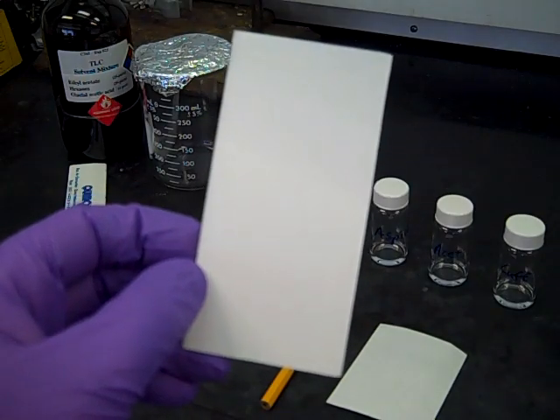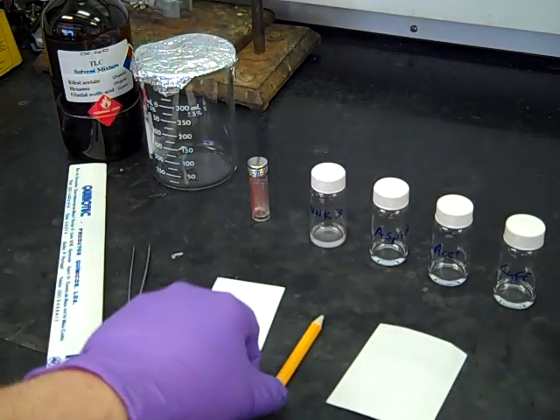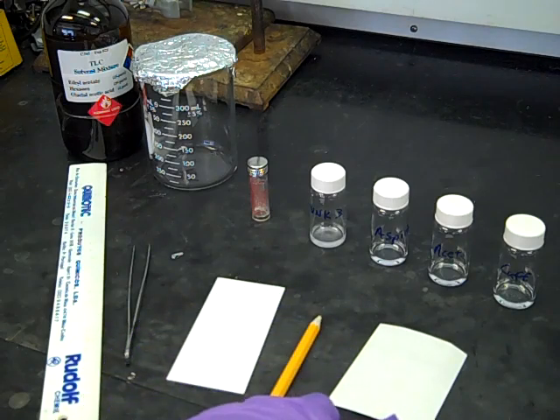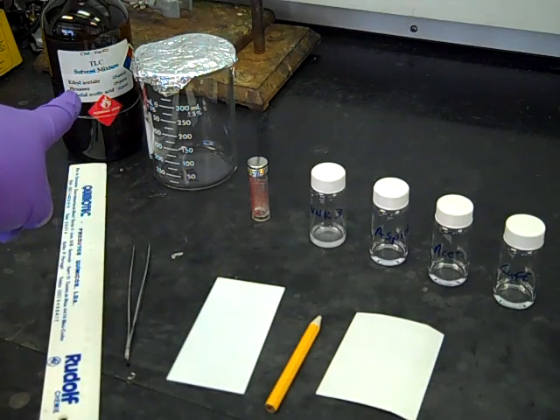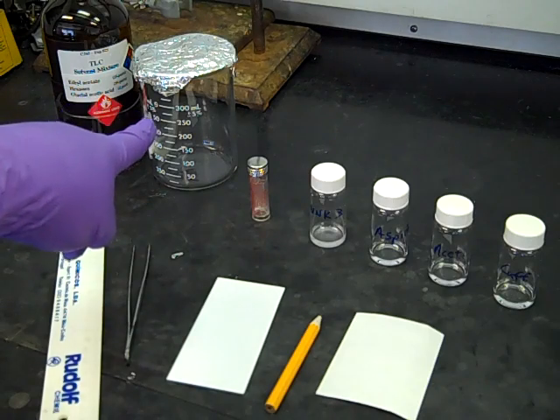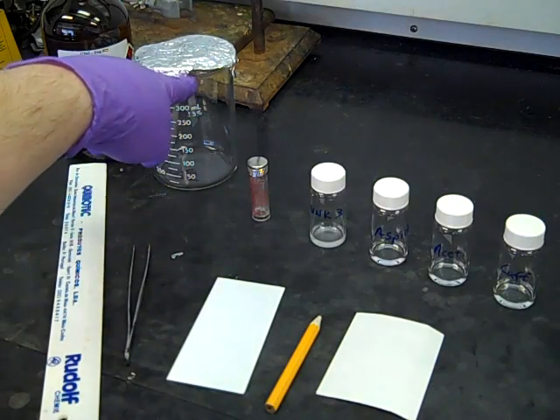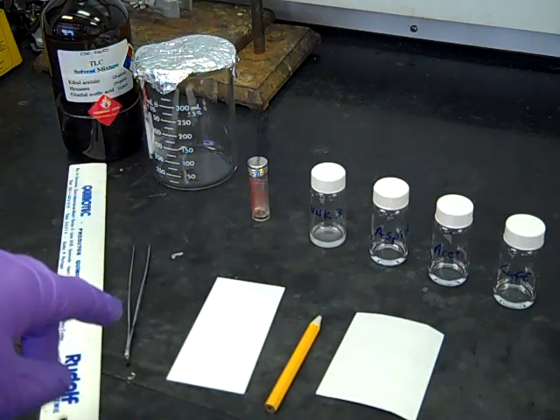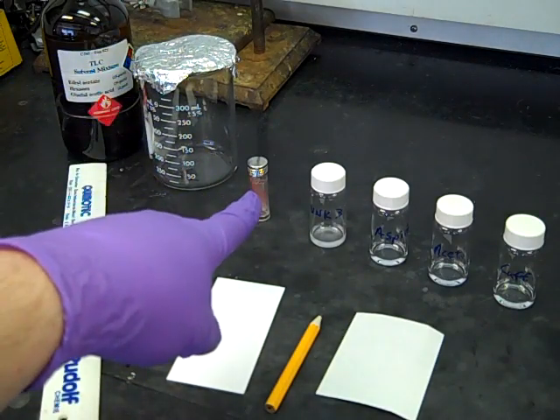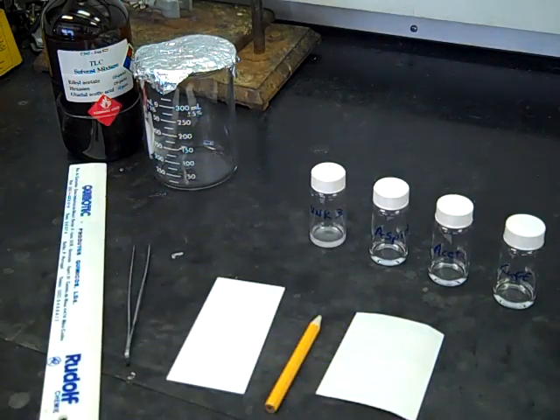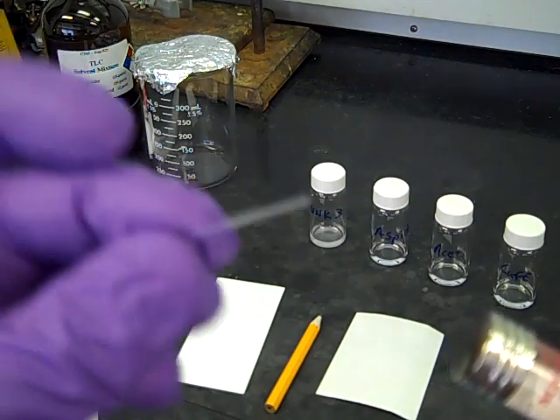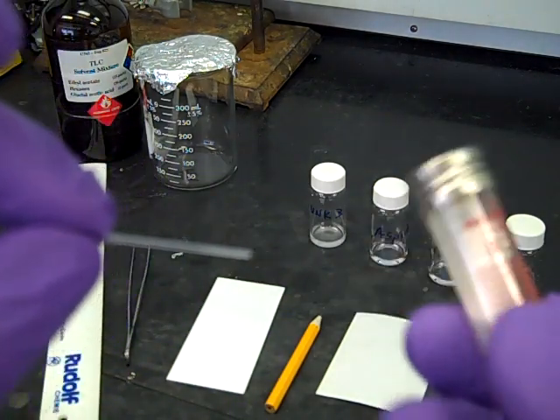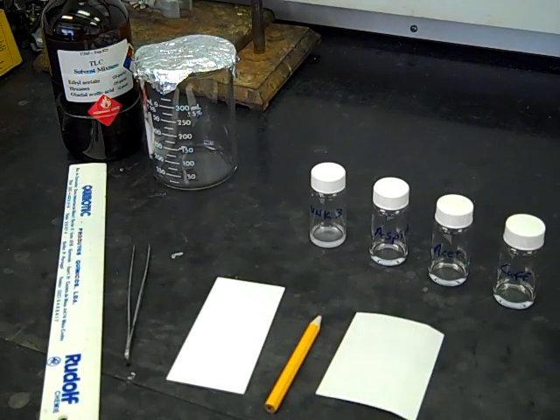You'll need a pencil to write on the plate, a filter paper wick, and our TLC solvent back there—that's the 15 to 10 to 1 mixture mentioned in the PowerPoints. We've got our 400 mL beaker with a foil lid on top that fits nicely like a cap. We also have micro capillaries, which are really tiny little glass tubes—open on both ends—that will be found in a container like this.